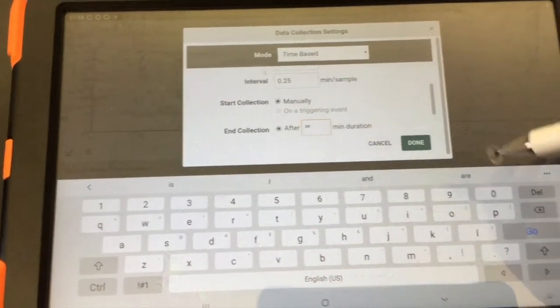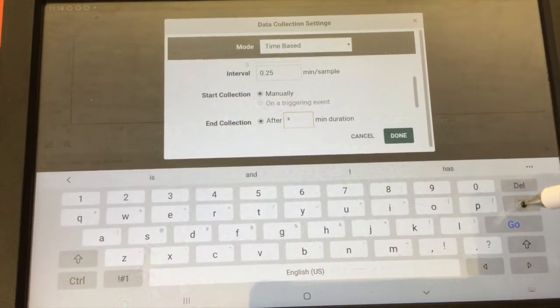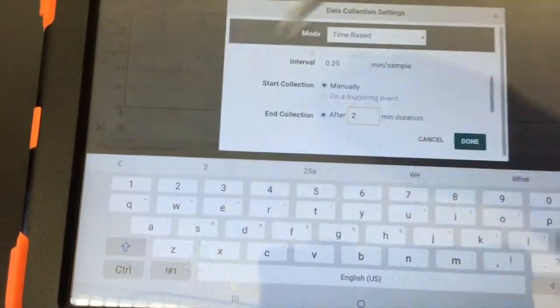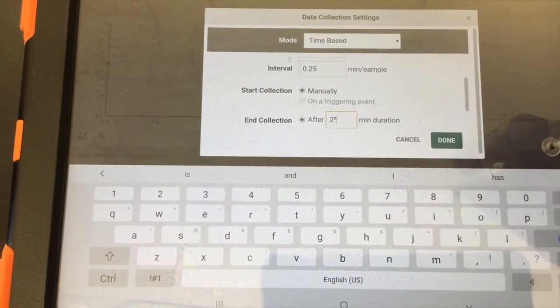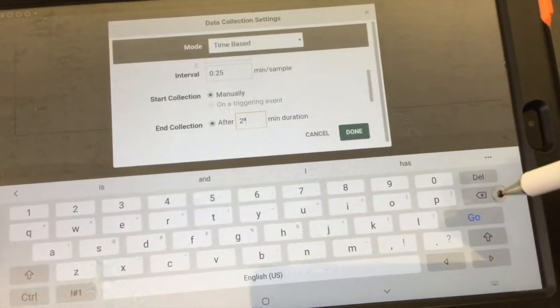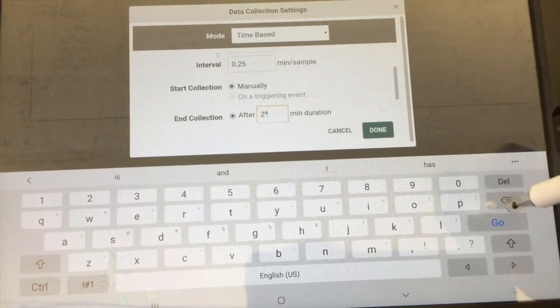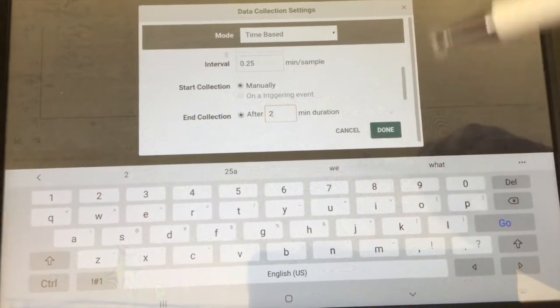I have got this superscript, I don't know why it does that sometimes but if it is superscripted it does not like it. So we are going to try it again, but once you get it not to superscript then you hit done.